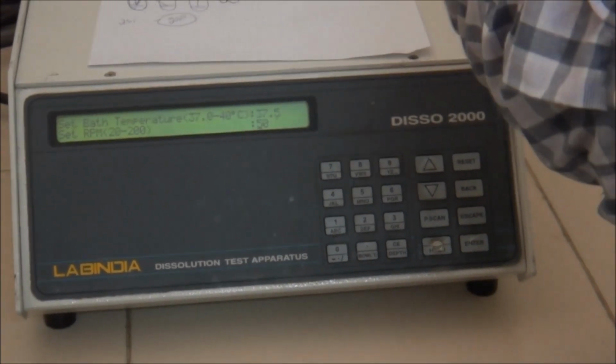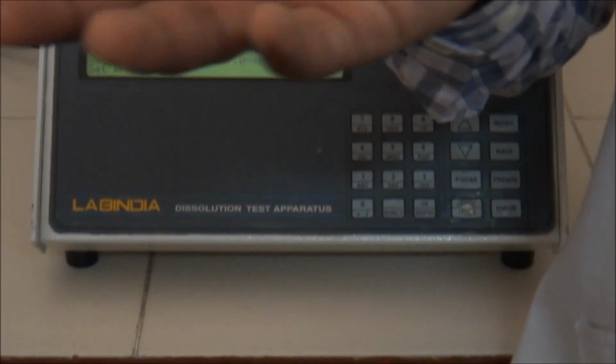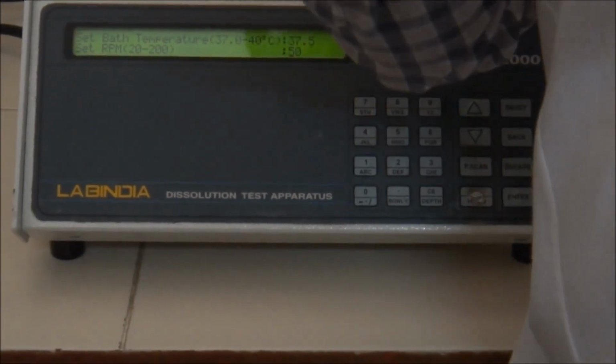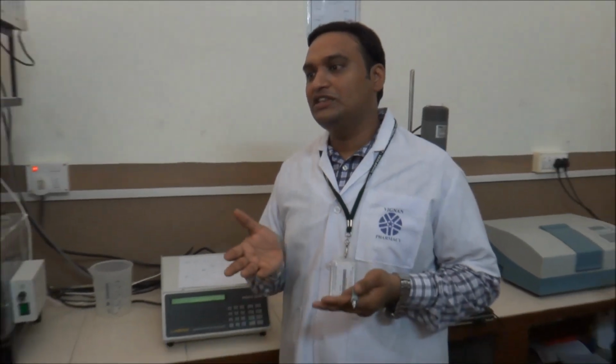That means it can perform up to 60% only. Obviously at 200 rpm we have 60% release. You are not going to get this release at 50 rpm. That means the maximum performance this tablet can give is only 60%.